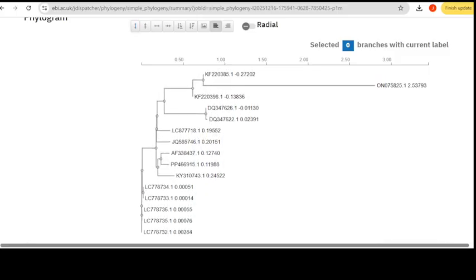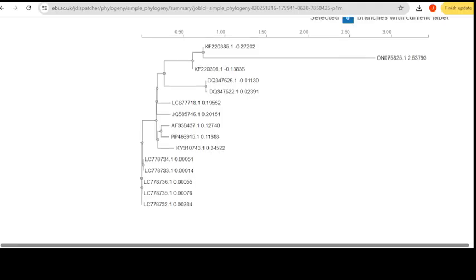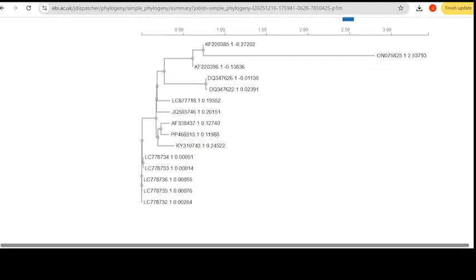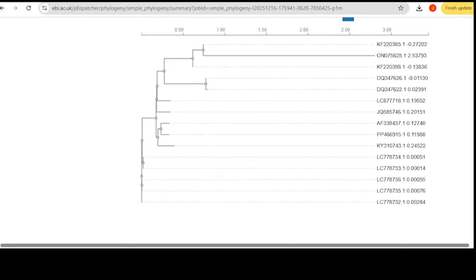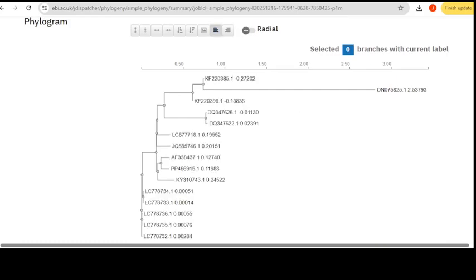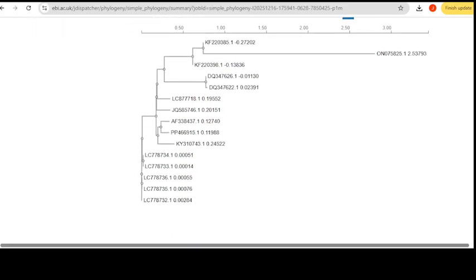It's wonderful. It depends on what font you want, what size you want, and where you want it. You can write a line with the names, or just have them right where the tree is ending. It's all your choice, how you like it.